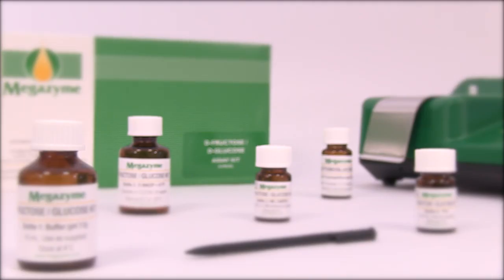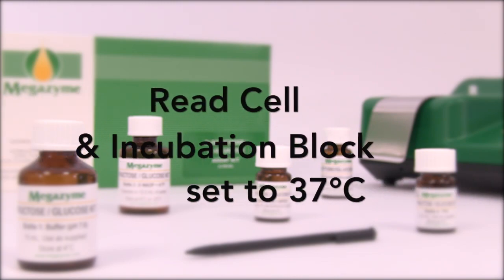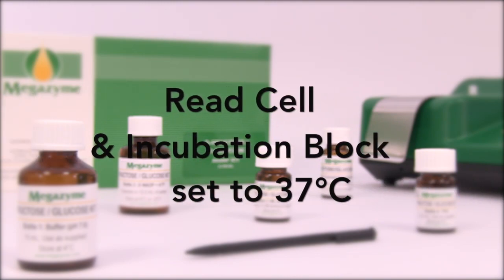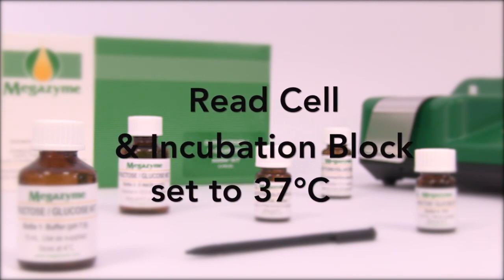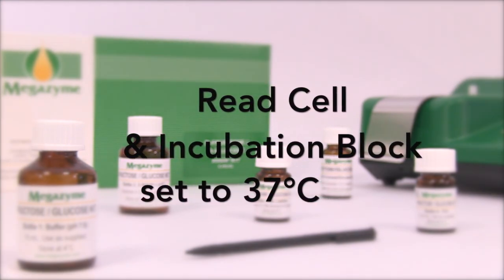To use the Megazyme test kits with the MegaQuant Wave, it is recommended that the read cell and incubation block are set to 37 degrees Celsius unless stated otherwise for the specific test kit that is being used.